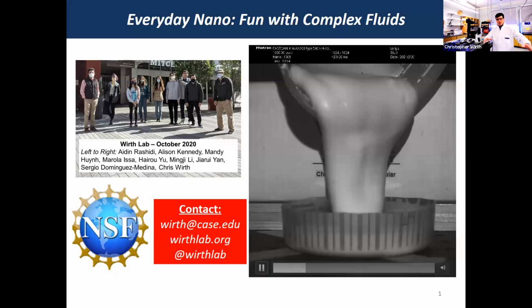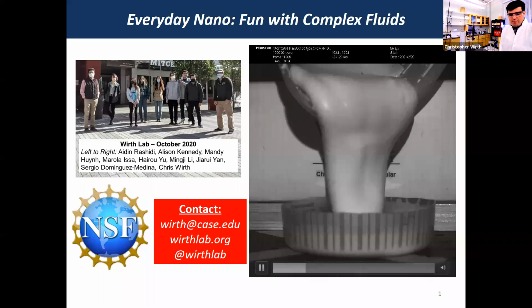So I'm unsure what levels all of our attendees are at, but basically in microscopy, you either look from above at a sample or you look from below at a sample. And this is one of the microscopes that you look at a sample from below. We also build custom setups. This is one custom setup here that you can see. Most of the components are off-the-shelf components that we put together in ways that are helpful for our projects.